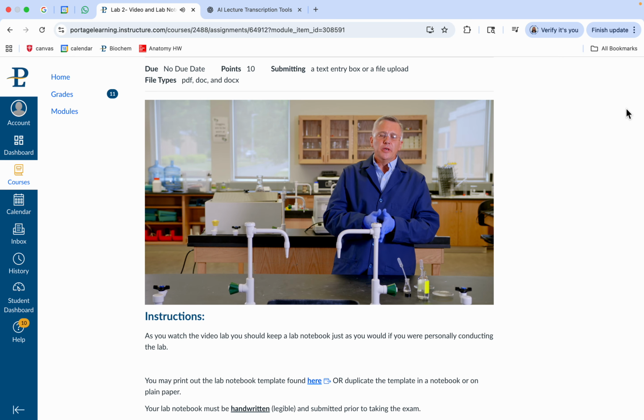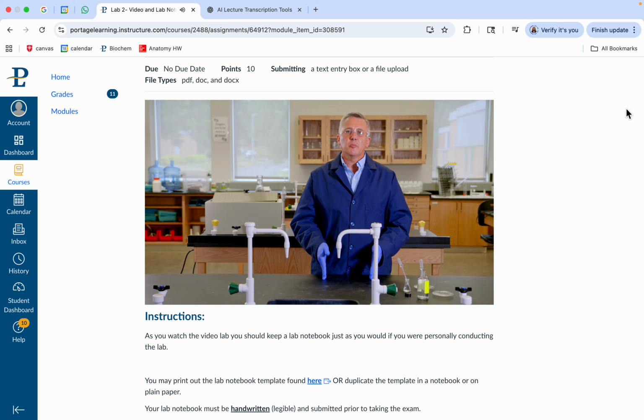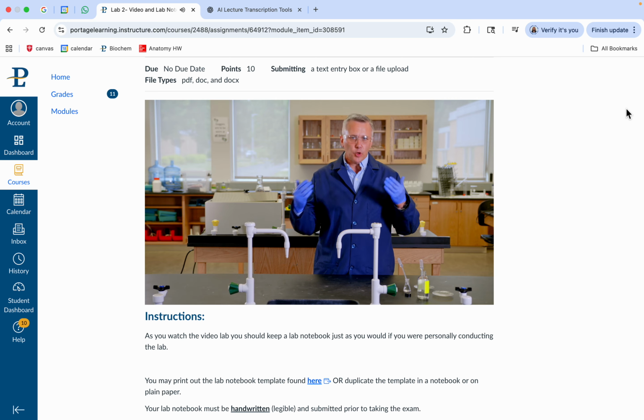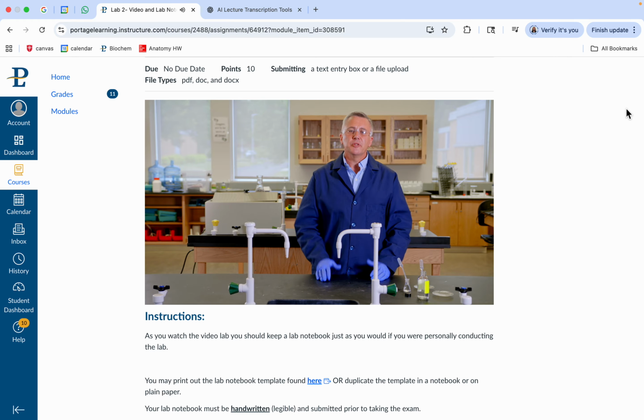Now again, we need to connect this with the intermolecular forces. So think about pentane, 33 seconds or so, it took it to all evaporate, whereas water took about 56 minutes. And again, it'll vary depending on the temperature in the room and airflow and that type of thing. But again, there's a significant difference, and we can connect that directly to the intermolecular forces. All right, so you might just think about the London forces in pentane, how strong they are compared to the hydrogen bonding in water. And we sort of know this intuitively, or we've heard it in class, the difference in strengths. But really, this is a great way to illustrate it, right? So we're talking a few seconds, 33 seconds, all the way up to 56 minutes.